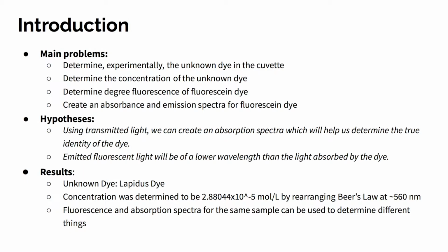In our introduction, we discussed some of our main problems, our hypotheses which involve transmitted light and emitted fluorescent light, and our results in which we discovered that we have Lapidus dye.